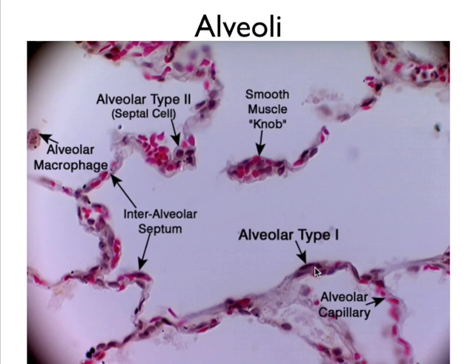This has a very thin stretched nucleus, and this one has a very round big nucleus. So in these air spaces you also find another cell called an alveolar macrophage. So it's a macrophage that protects you from things that you breathe in. It can phagocytose particles and bacteria and viruses that move into the alveoli from the outside.